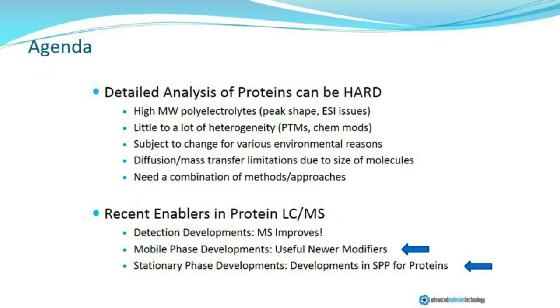Now, to set the agenda for today's discussion, we continue to have an ongoing technical challenge with separations of proteins and peptides. That's because these are generally not trivial mixtures, and any opportunity we have to either speed things up or improve our resolution of these complex mixtures is generally useful.